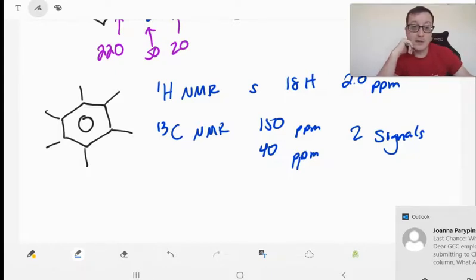It can help you decide if you have an aldehyde or a ketone versus a different carbonyl a little bit better than IR will. However, aldehydes are very distinct on proton NMR. You see that lovely aldehyde peak at 9 or 10 or so, and it's usually a singlet unless you have some weird long range coupling happening, but weirdness happens.